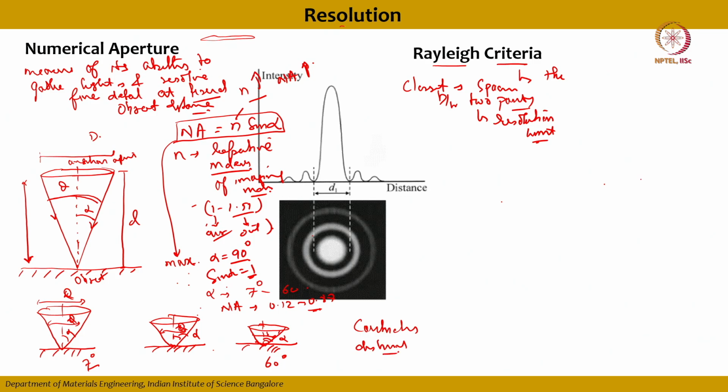Especially these light rays, if they move around pinholes for a light, then the parallel beam of light, which is a spot, is transformed into a series of cones that are seen as circles known as Airy rings.